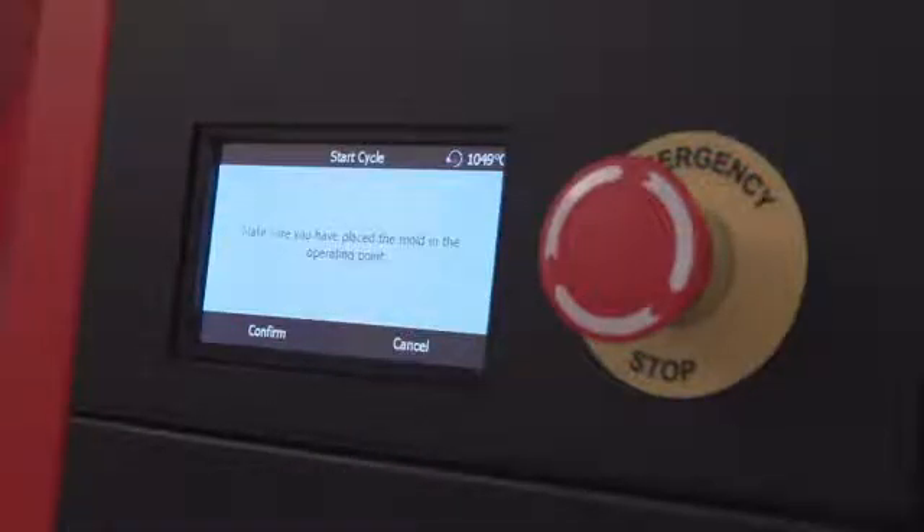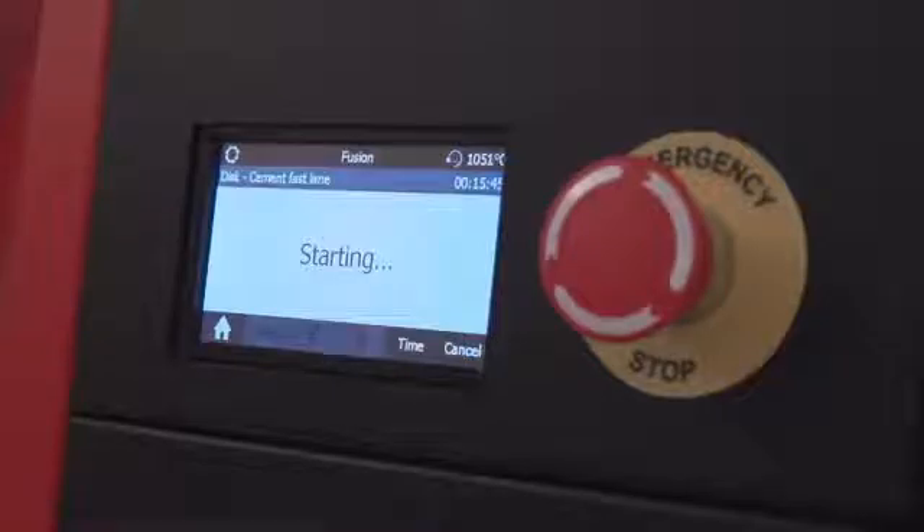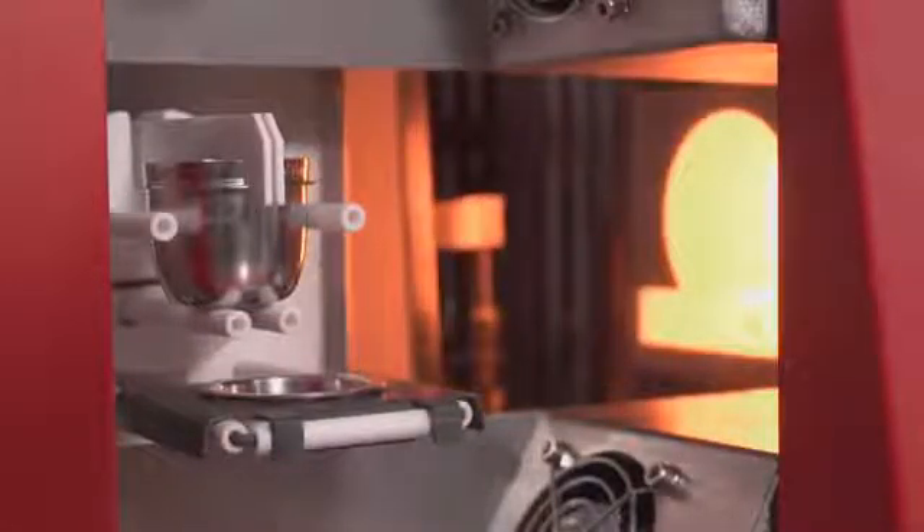Once the mold installation is confirmed, the fusion process starts. The automated carriage inserts the mold and crucible into the heating chamber. The preheat timer feature can activate the preheat session before the start of the fusion process to save time and increase productivity.